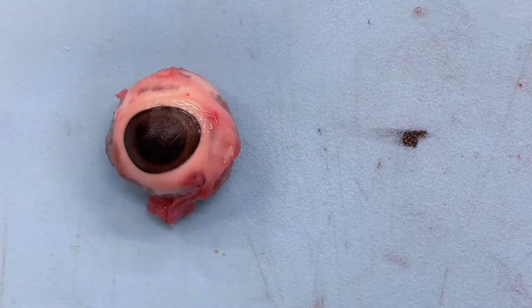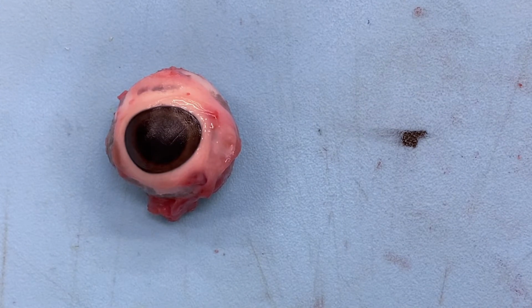Orientation, like I said, is not key. Ultimately, we're going to probably submit this specimen entirely. So we're going to go for our main pupil to optic nerve section. And that's kind of the biggest thing we want to get out of this. And honestly, we're going to deviate from our orientation in order to make sure we get tumor in that section if possible.